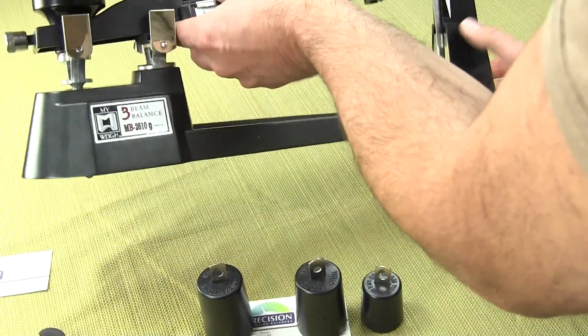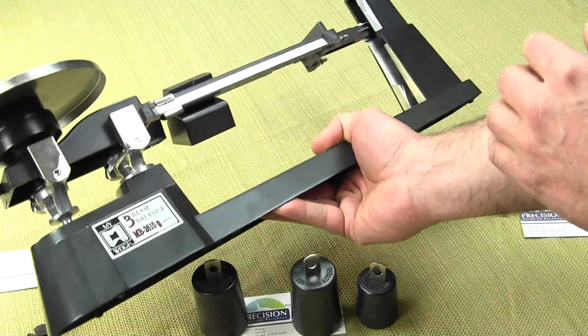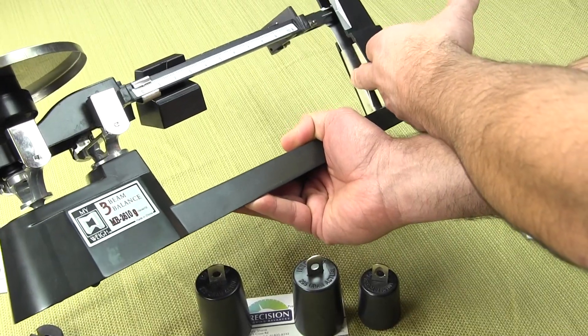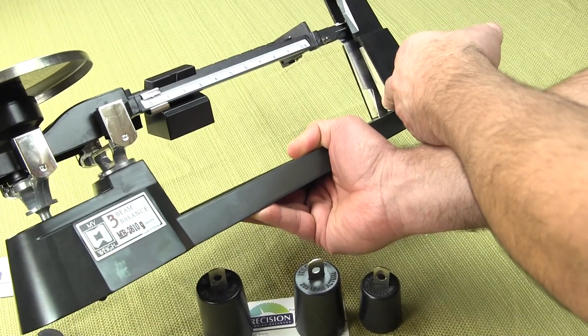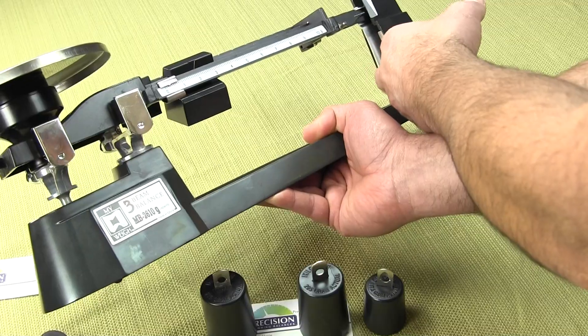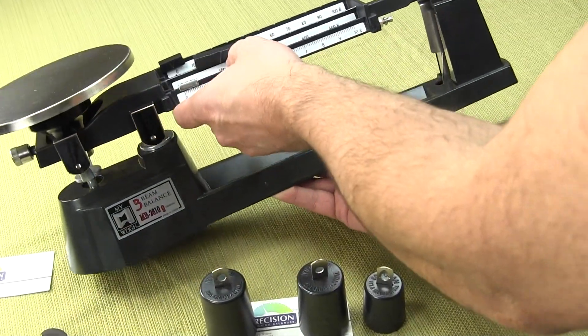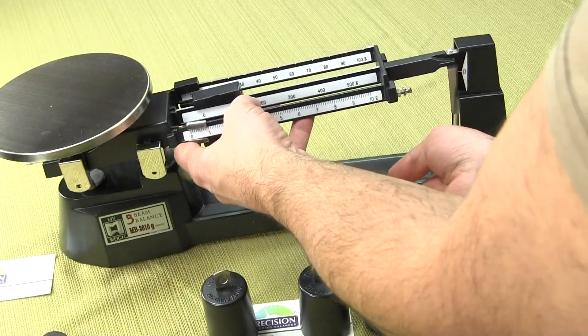On the other end of the three beam balance we have a fin here. This fin goes through two magnets to slow down the oscillation. So that's the basic three beam balance.